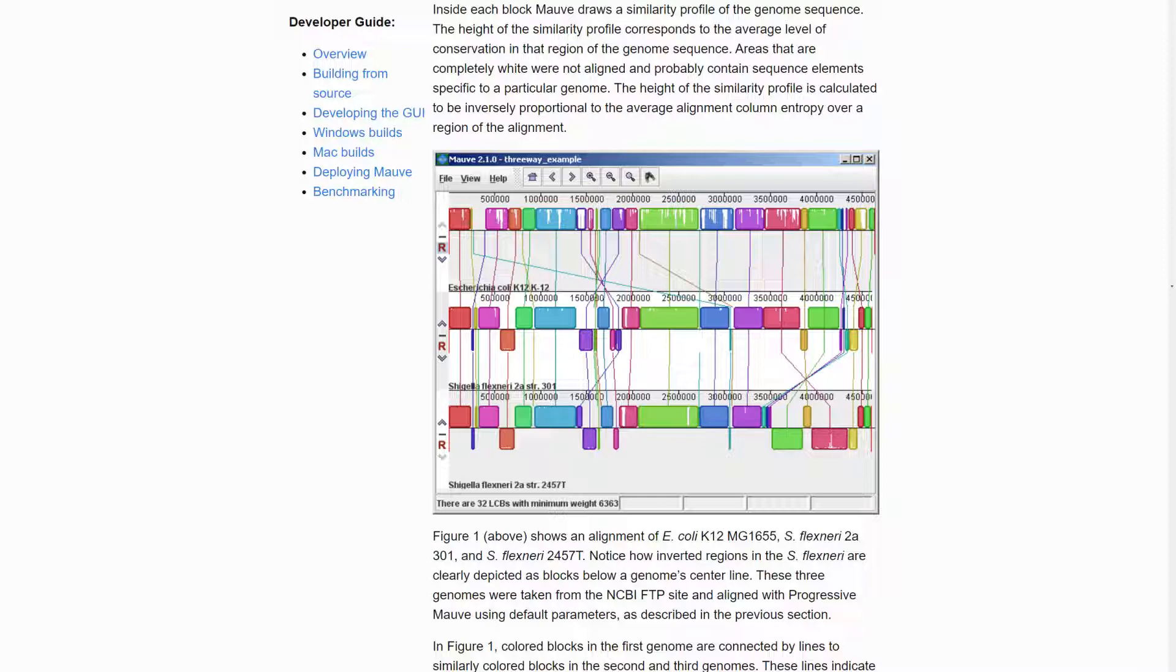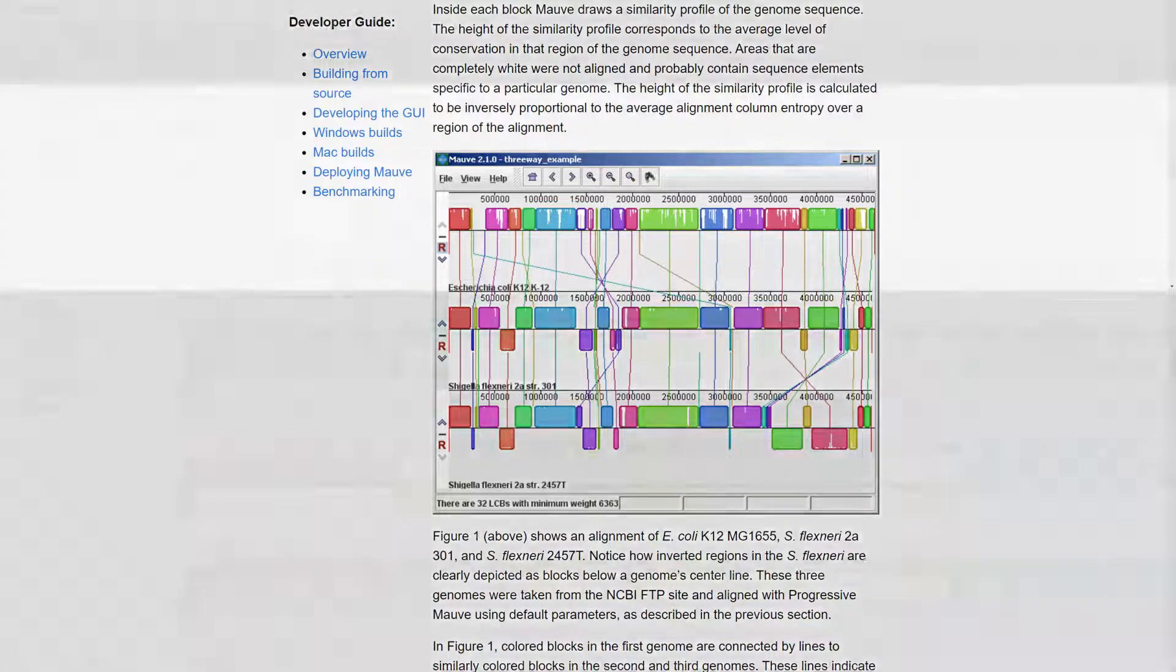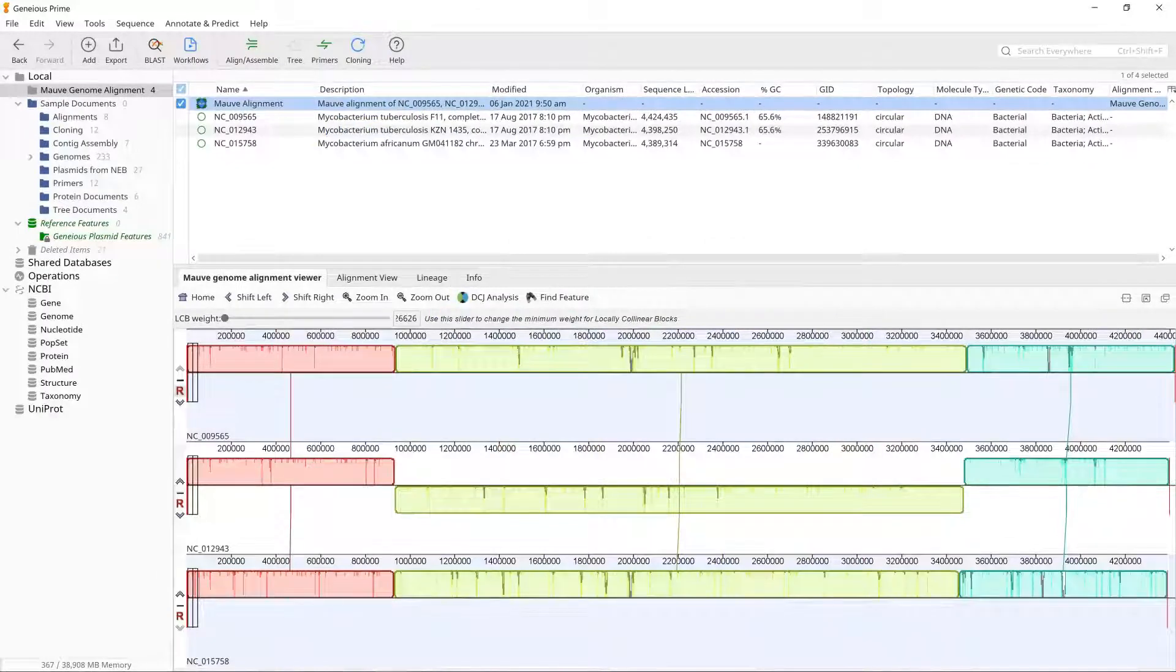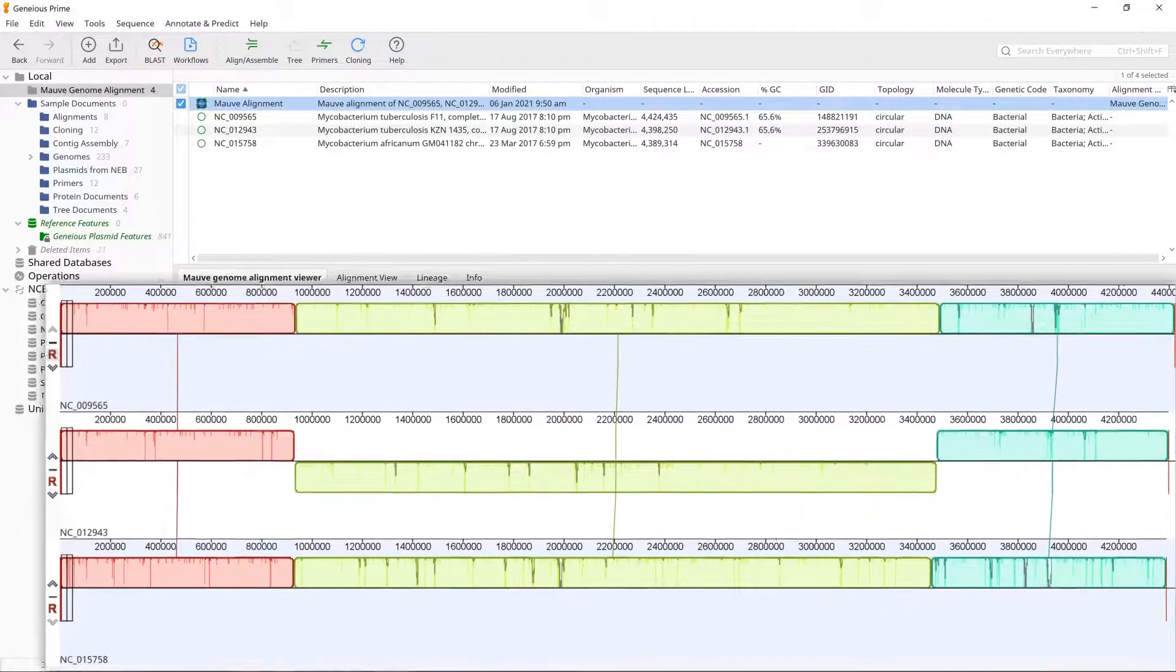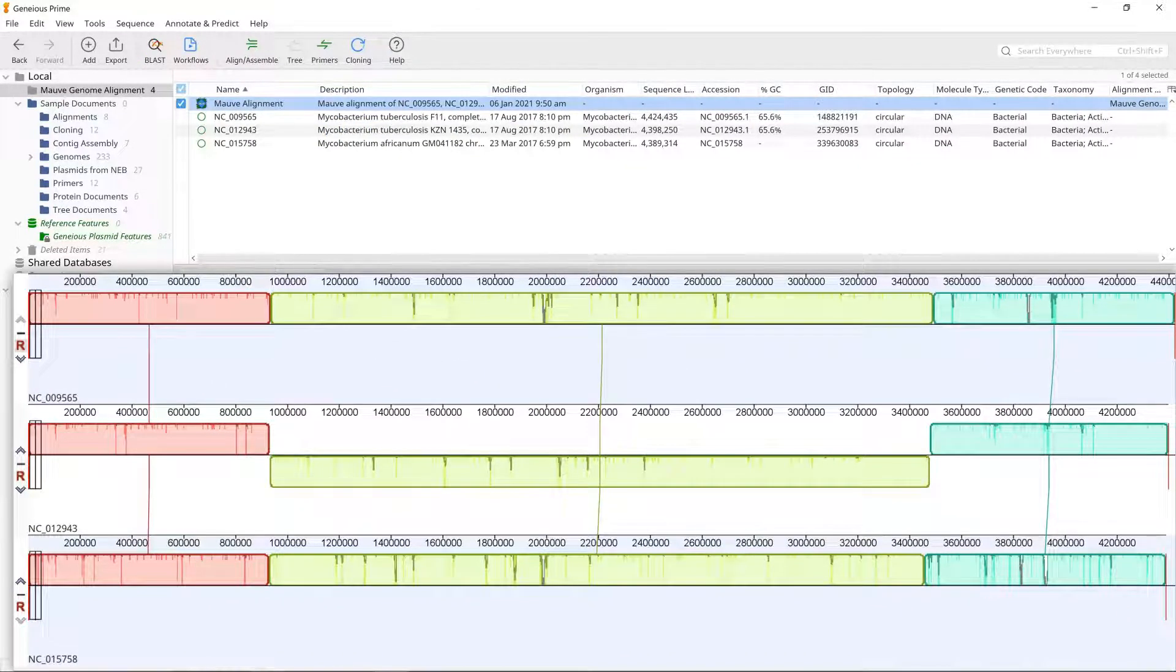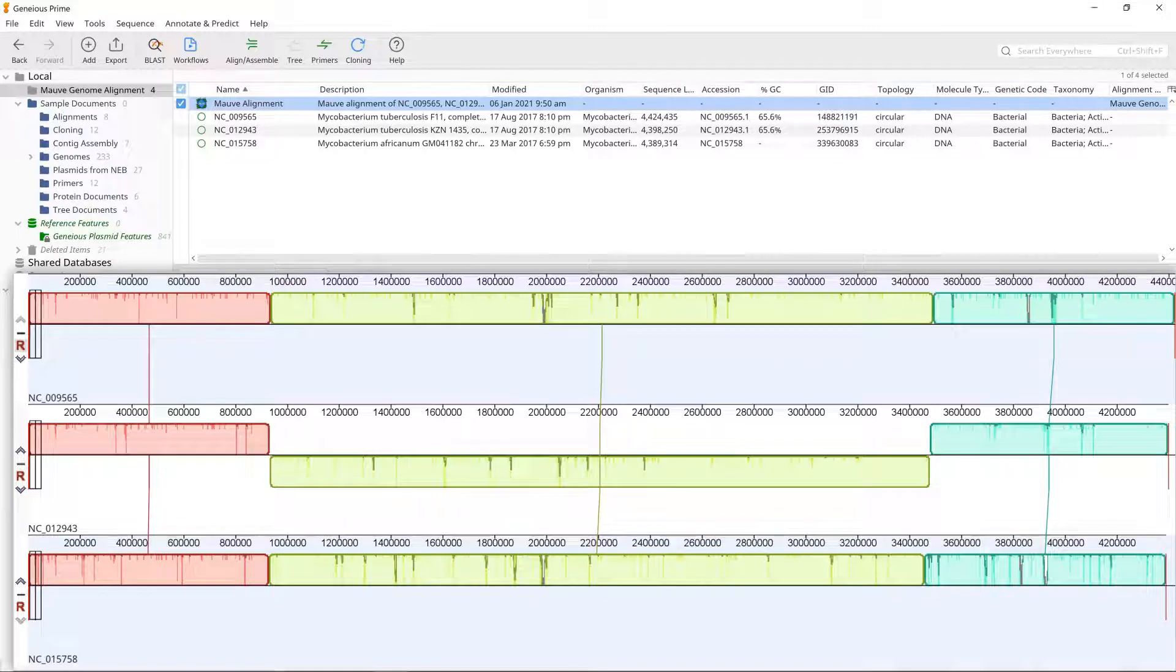The colored blocks in each genome are connected by vertical lines. In this example, you can see there are three LCBs denoted by the different colors.